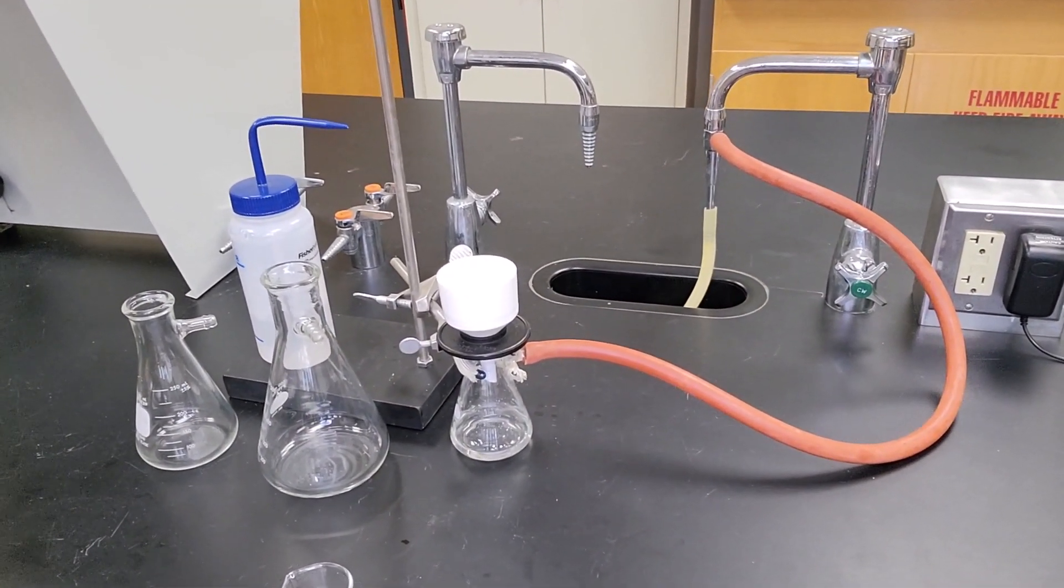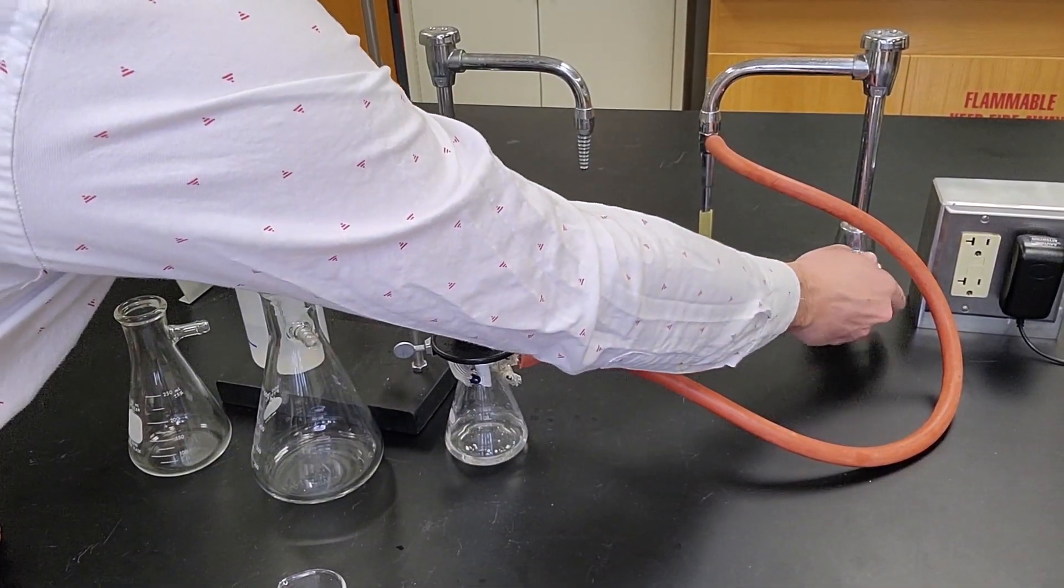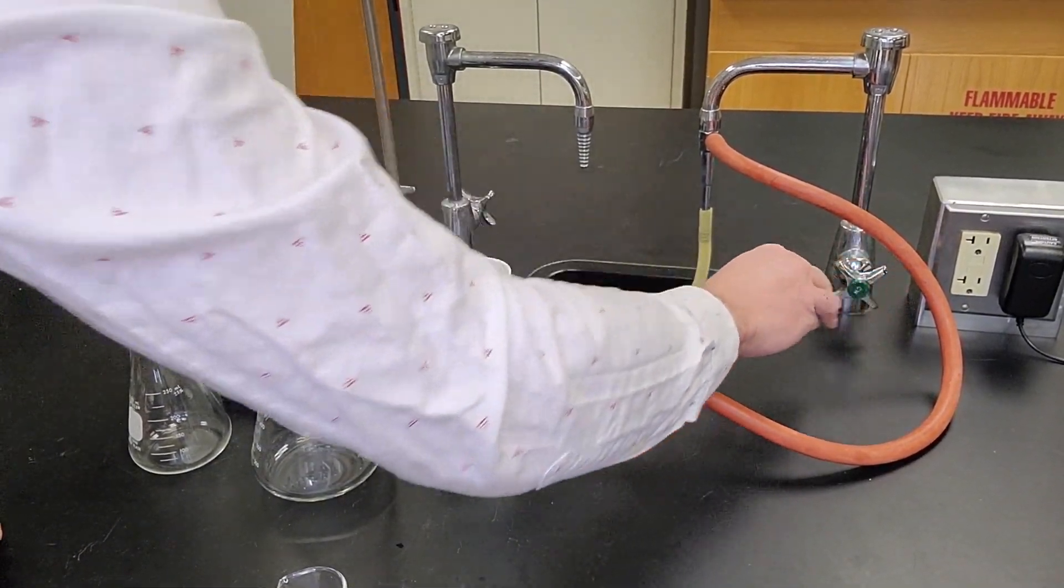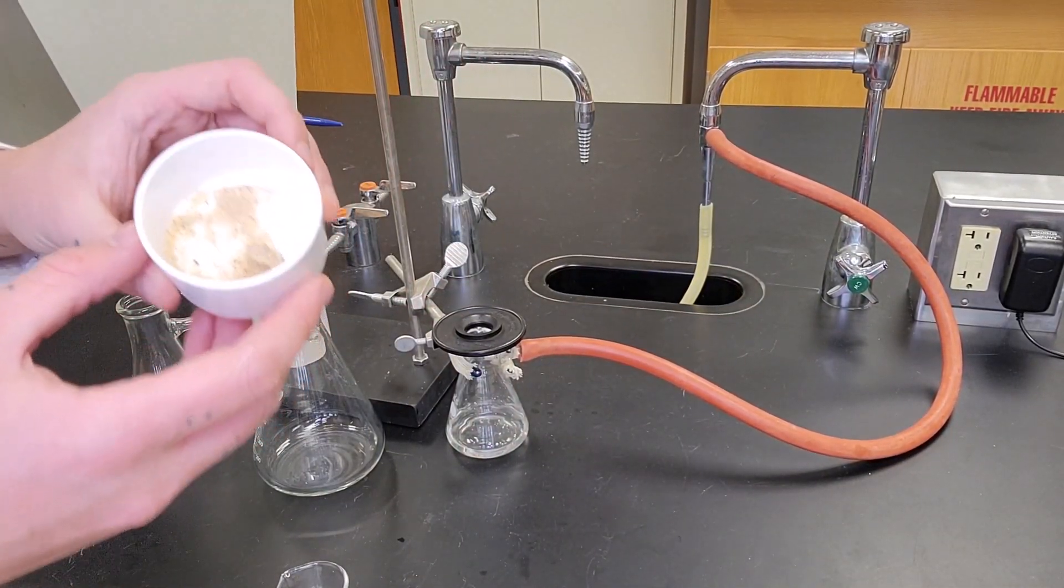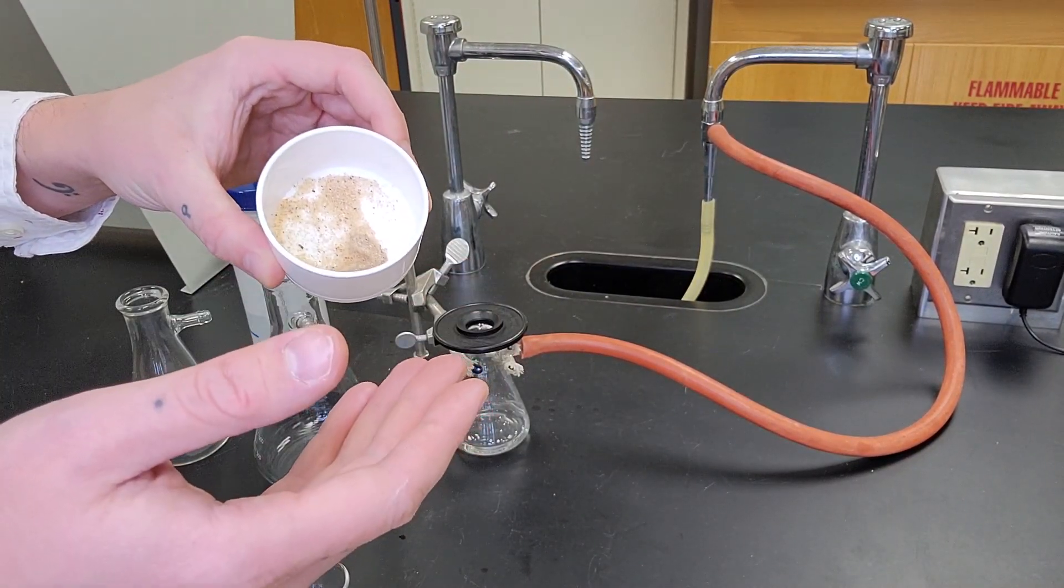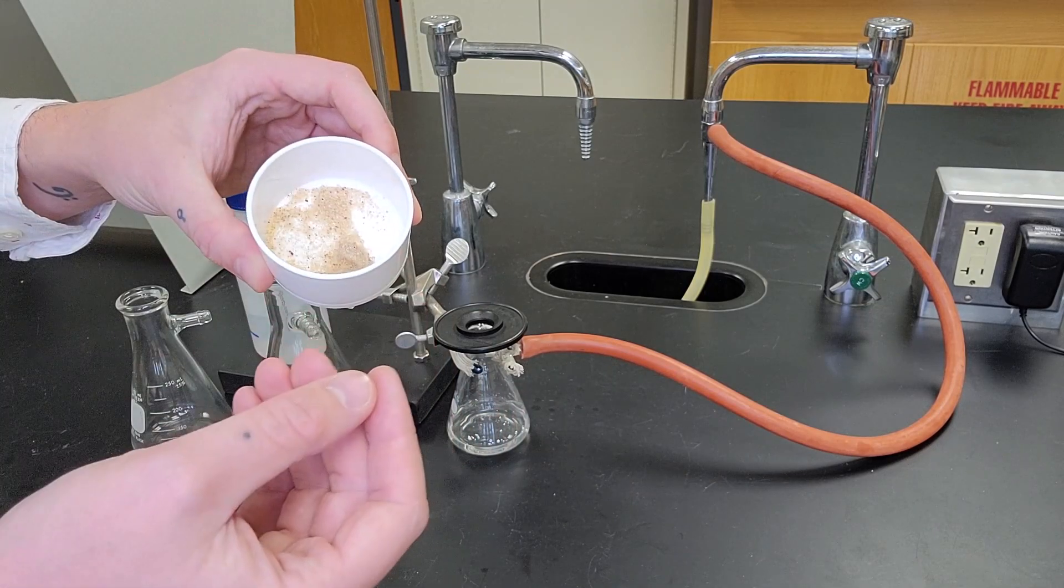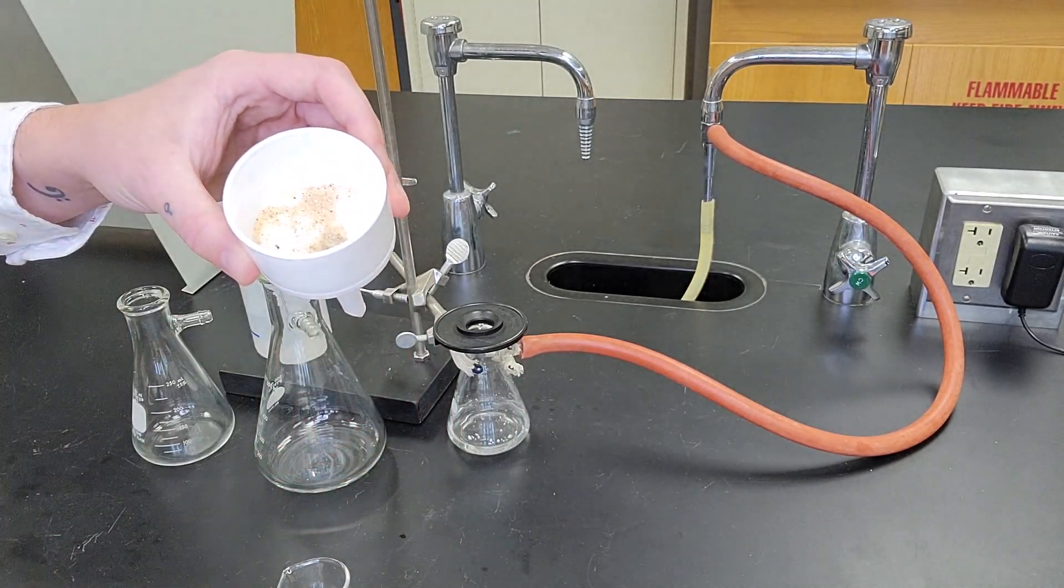And we've successfully done a vacuum filtration. At the end, I would just reach over and turn off my water, and this Buchner funnel will lift right off. So I now have dry solid that I can go on to the next step with—get a percent yield, mass it, get a melting point, whatever I need to do with the solid—I can now move on to the next step.